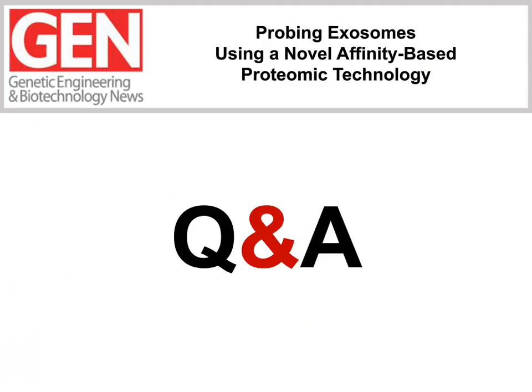Okay, so the first question we have is for Steve. First, a little kudos to you, Steve. Thanks for a great presentation on the SomaScan technology. I was wondering if it is possible to detect post-translational modifications or changes in tertiary structure due to amino acid substitutions.